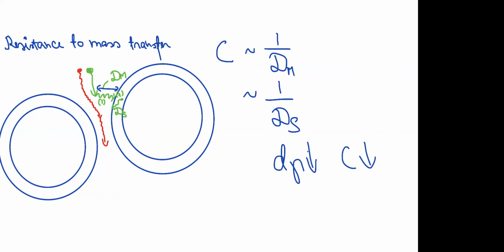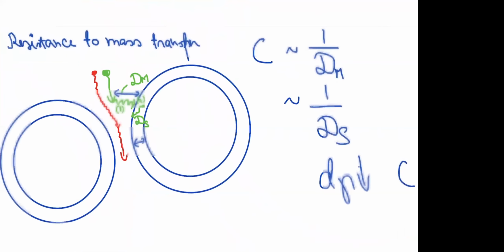And another important factor is how wide the stationary phase is. So how thick a layer of stationary phase we actually have.